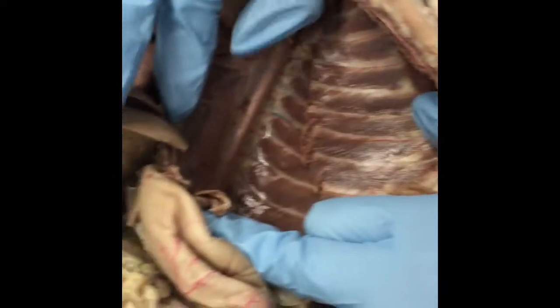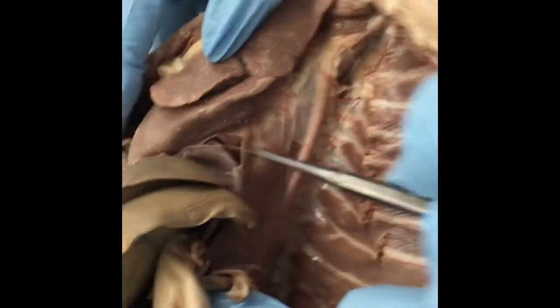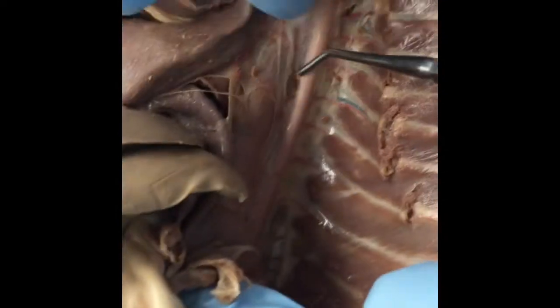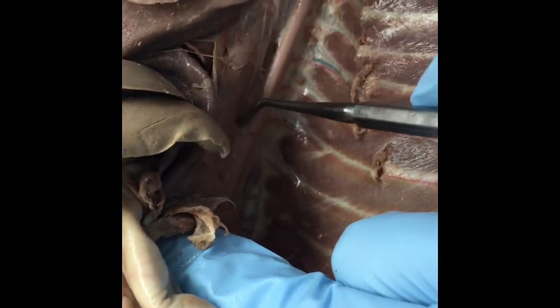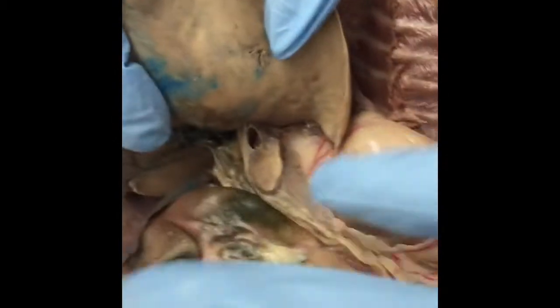Okay, so this is the dorsal aorta, and then that is the esophagus. And then the vagus nerve is one of those white lines. That one. Which one? This one? That one, going down. This one. And then we get to the stomach.